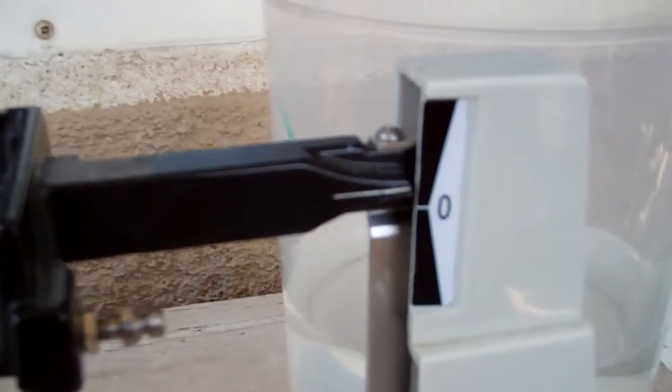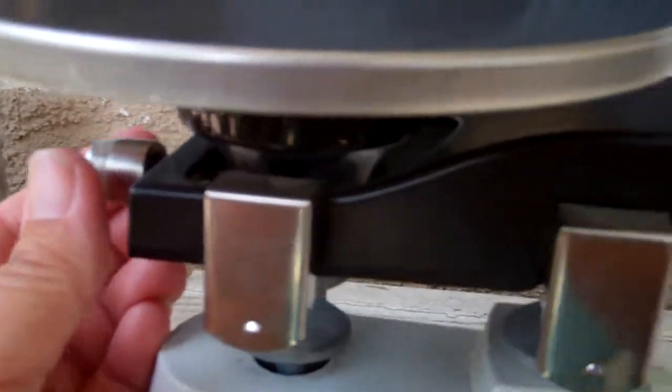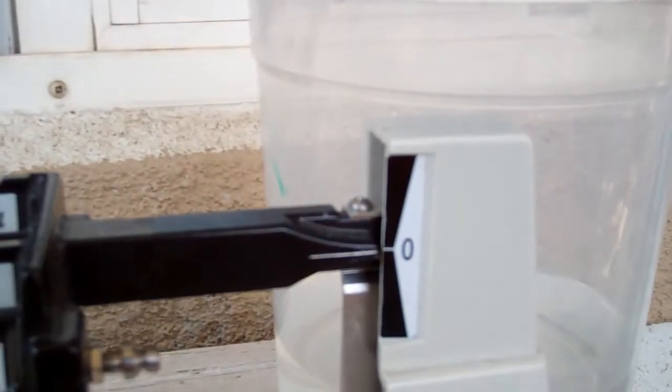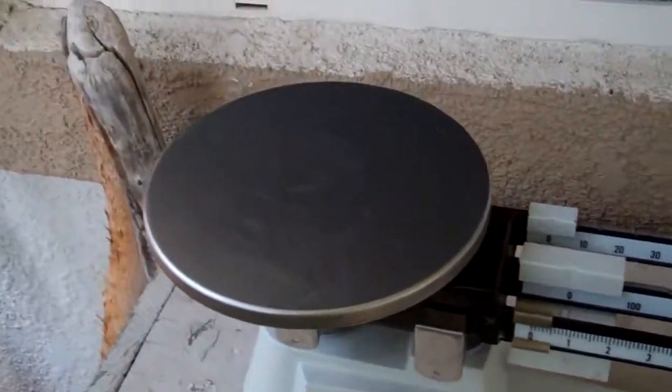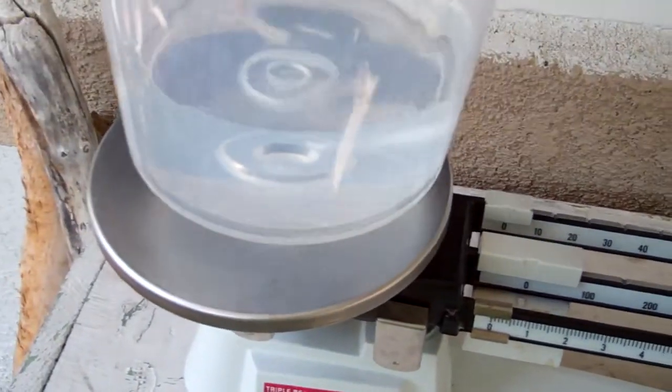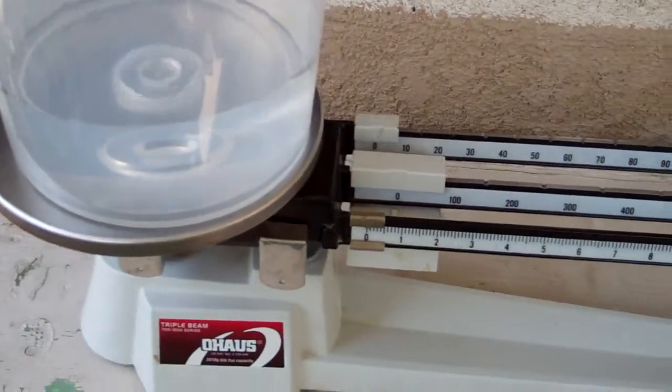So once you have that done, by turning the knob, and that's zeroed, then you're ready to go. Put your object that you want to get the mass of on the pan.